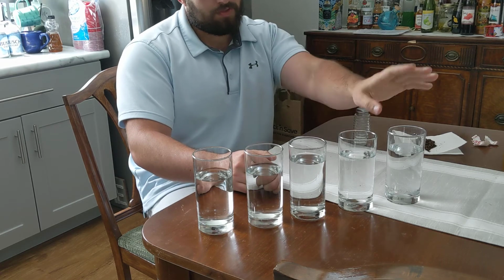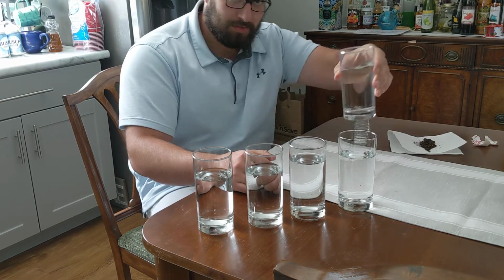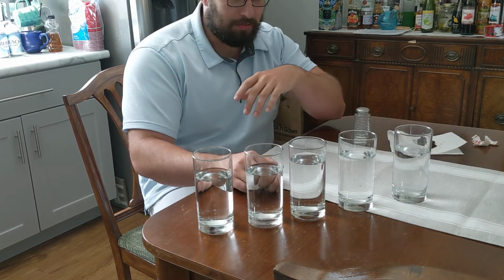So, first one we got right here. This is going to be our control. This is what water looks like. This is water. Good old normal tap water.